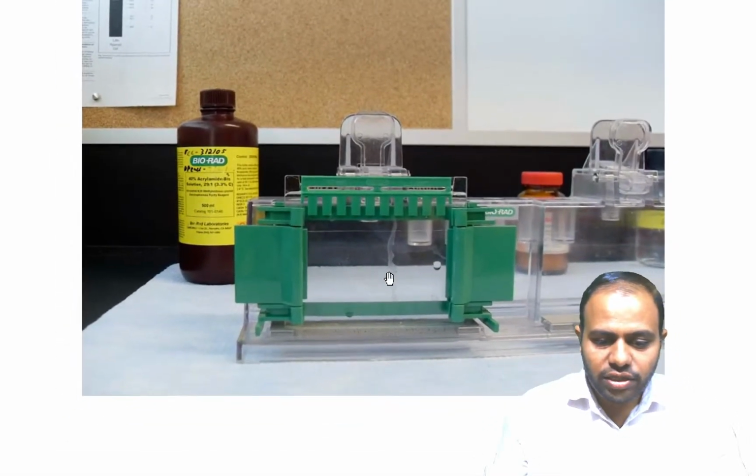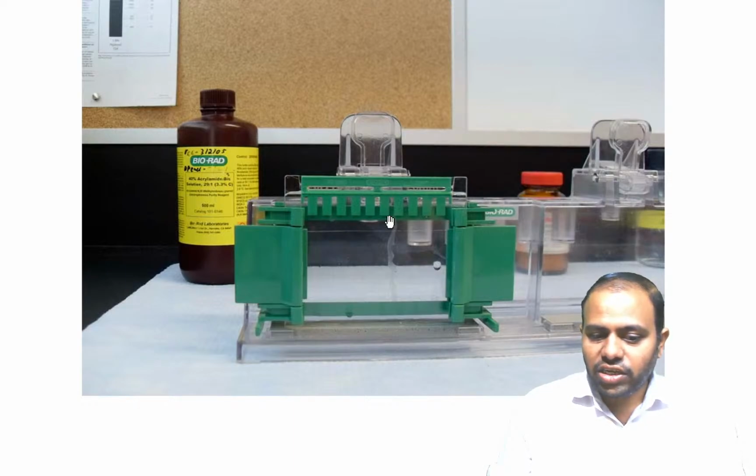Okay, you can see this interface is actually the difference between the stacking gel and the separating gel. The upper one is the stacking gel, and the lower one is the separating gel. Okay, and you put the comb, and slowly you remove the comb afterwards, after the gel is polymerized. The comb has to be removed very slowly.